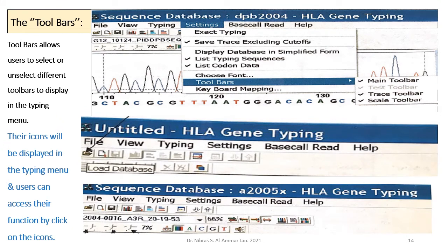Now the toolbars. Toolbars allows users to select or unselect different toolbars to display in the typing menu.